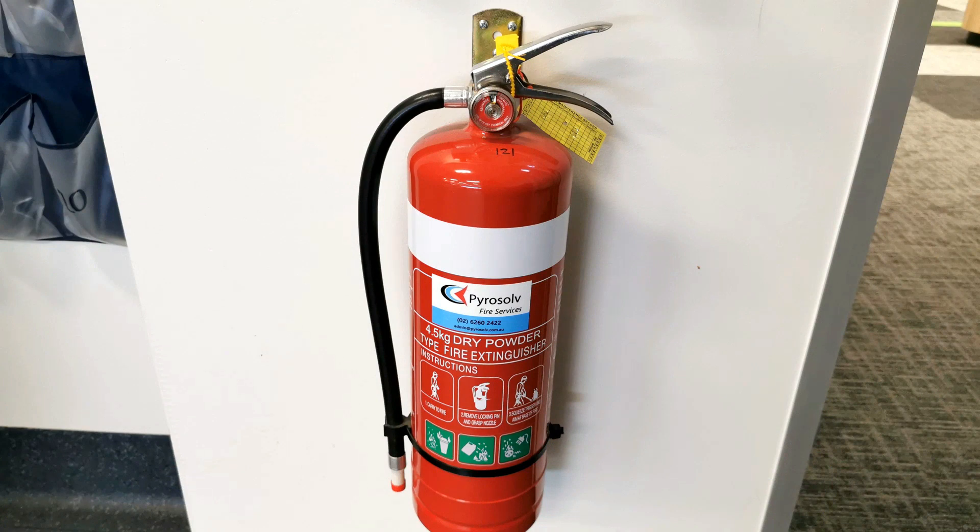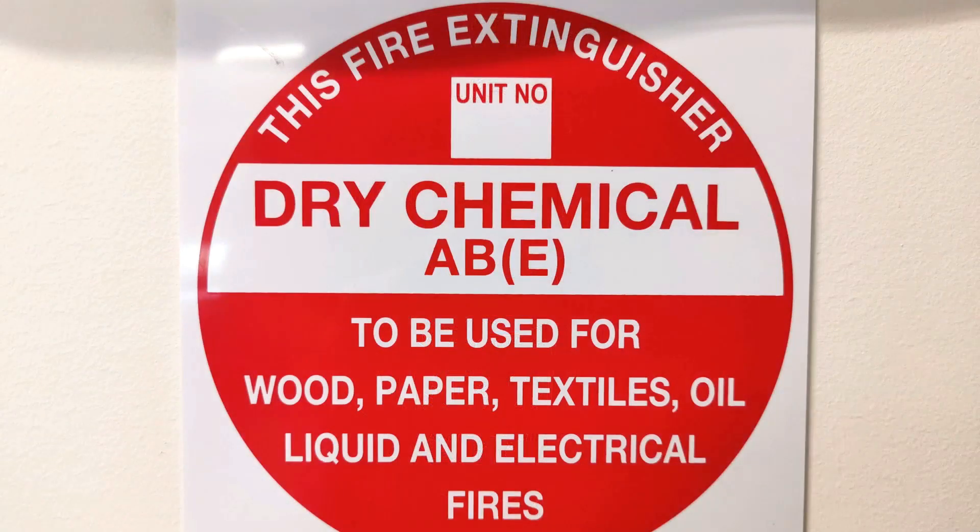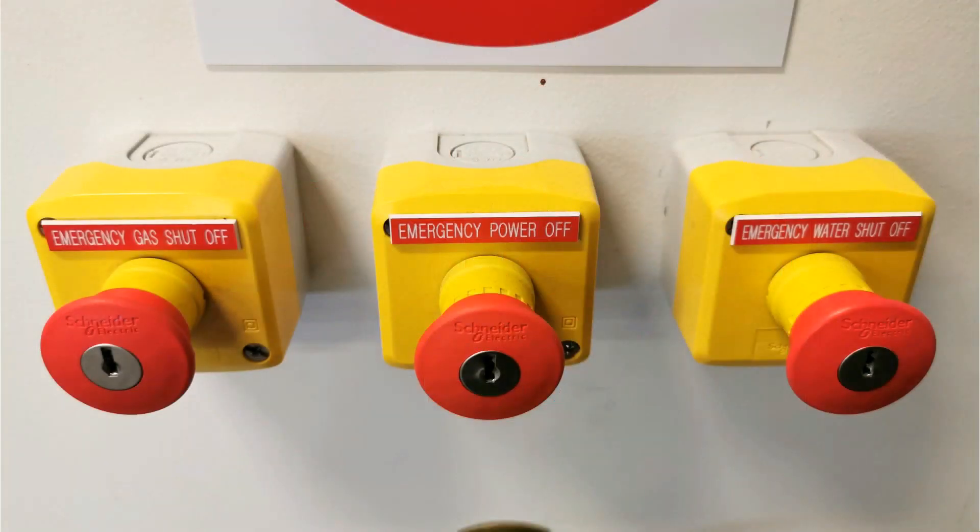In any lab you should also have a fire extinguisher. You can get different types for different fires — this one is good for wood, paper, textiles, oil/liquid, and electrical fires, so it's pretty general. We also have emergency shutoff switches — anyone should be able to hit these, and everyone in the lab should know where they are. If you need to push the button, just push it. A key is just to release it so you can have your power, gas, or water back; your teacher will be able to turn them back on.